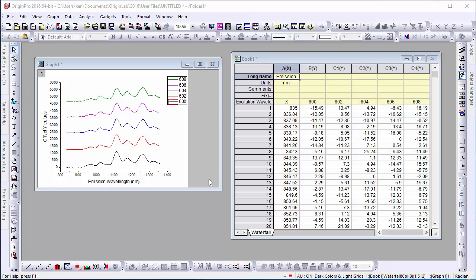Here we see a Y offset graph showing a series of emission wavelengths. By default, our legend will be in the top right corner of the graph, but in this case we want to place labels next to each corresponding curve.